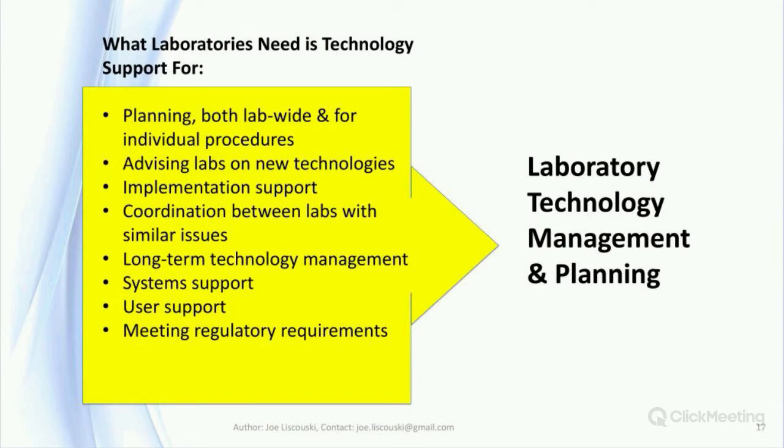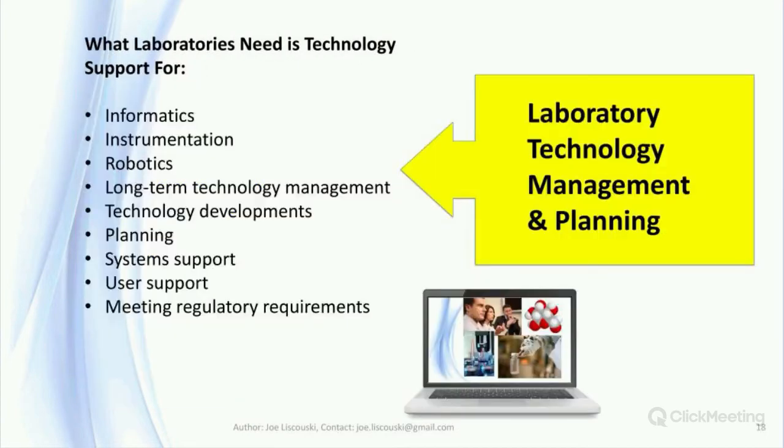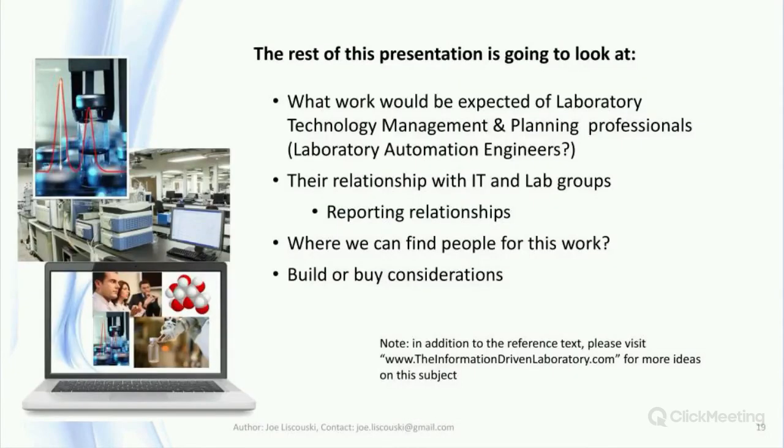What we need are people that are educated specifically for laboratory technology management and planning. This is more than just an IT function, as it embraces the full gamut of laboratory systems, their interactions and interdependencies. These people would have to work with IT groups cooperatively and be responsible for resolving conflicts and policies.